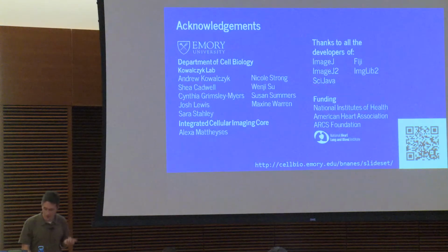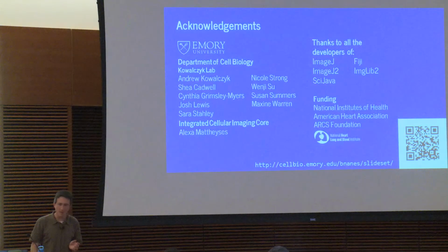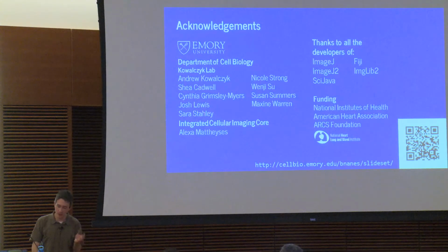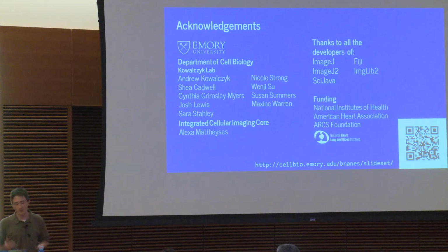So again, I think the goal of SlideSet isn't to be another tool to move people away from interactive analyses towards automation, but given that interactive analyses are so common, to bring automation into that interactive workflow and try to get some of the benefits of both.